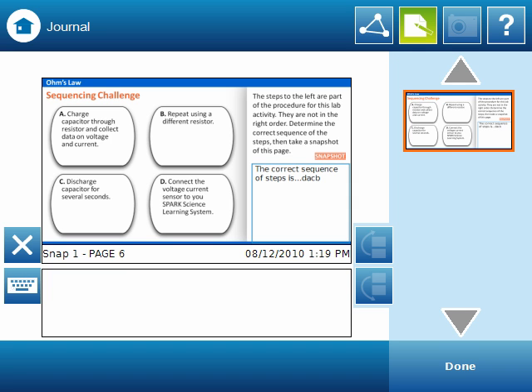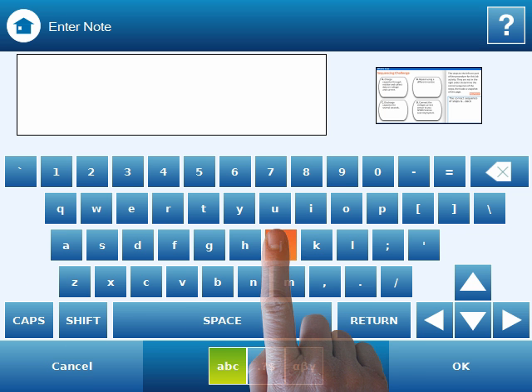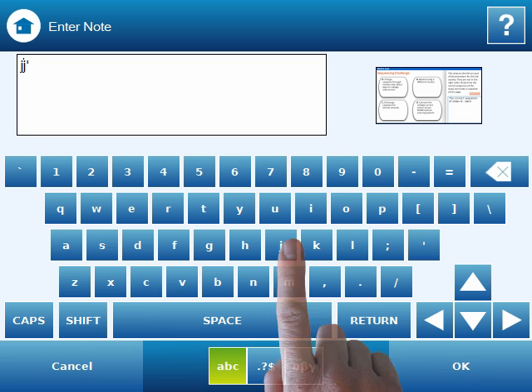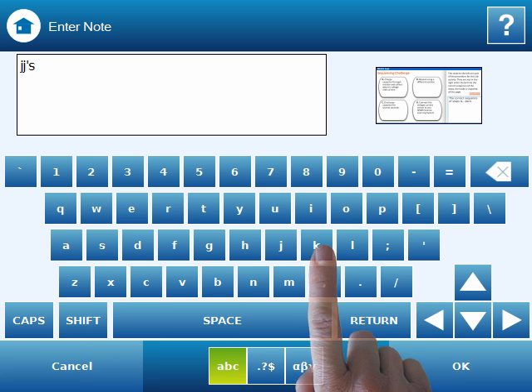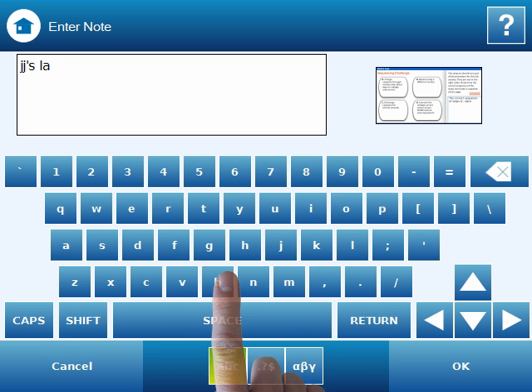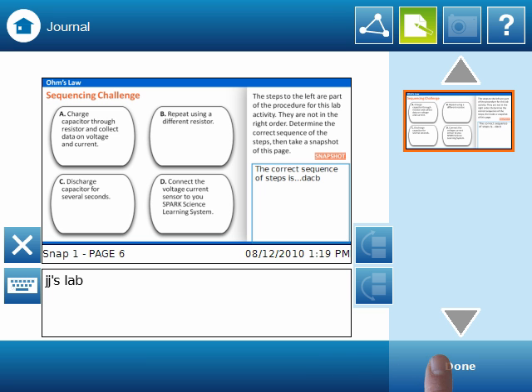To make notes, simply select the keyboard icon and enter the text using the on-screen keyboard. Select Done when finished.